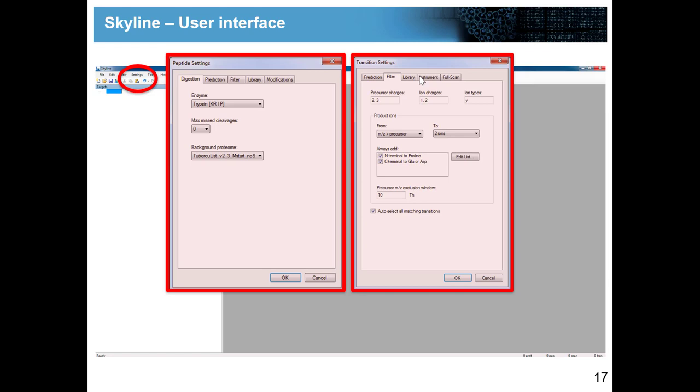Also in these transition settings you define which transitions you would like to work with, how many transitions from a library you would like to have. These settings, these two settings, are really really super important. When people come to me and say Skyline is not working, it's not doing what I wanted to do, it's almost always the case that something in these settings is not set accordingly. I can just really emphasize you should pay good attention and you will learn a lot about these settings in these next two days.